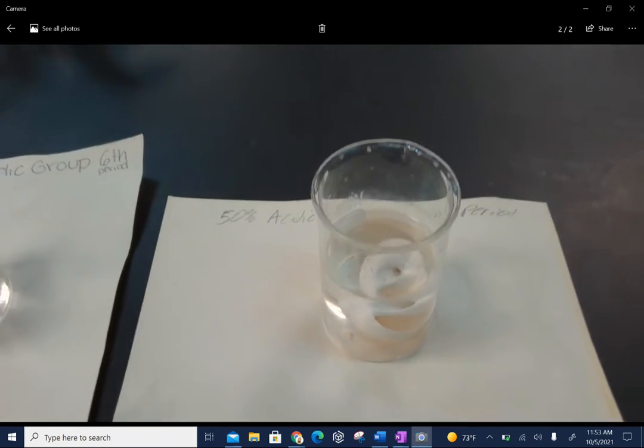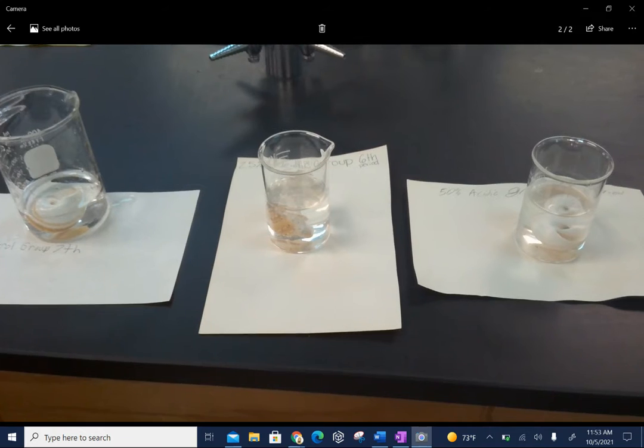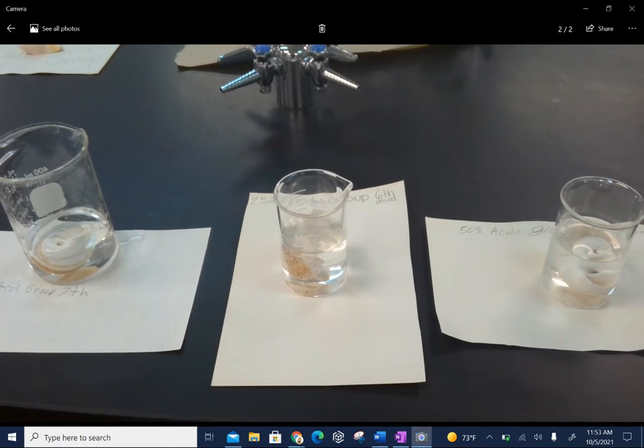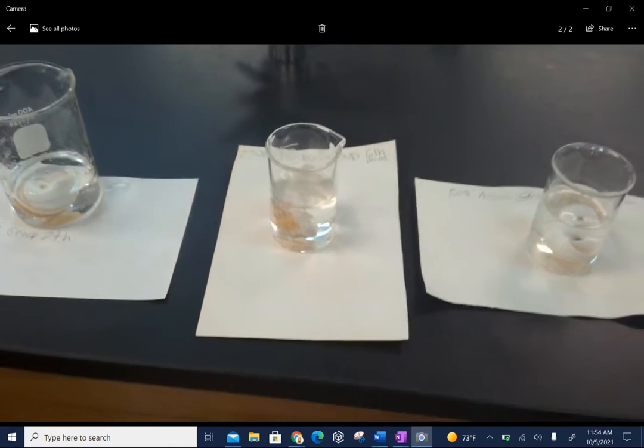So this way, we can simulate different acidic conditions that are occurring in our ocean and then observe how that affects our seashells. So we took the mass before, and then today we're taking the mass after.